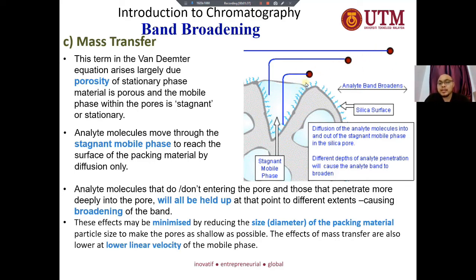So when that happens, the analytes will diffuse or penetrate deep inside the pores, and they will only be able to reach the flow of the mobile phase via diffusion. When that happens, it will cause differences in the time of elution, and it will cause analyte band broadening.